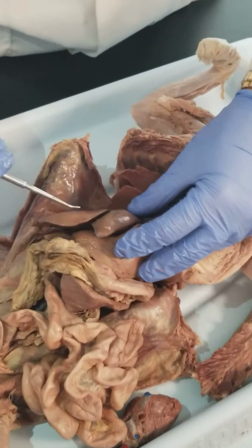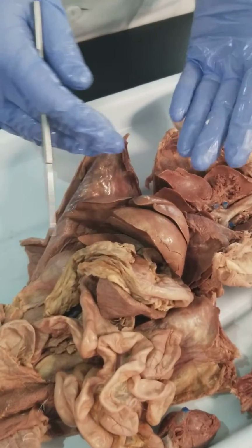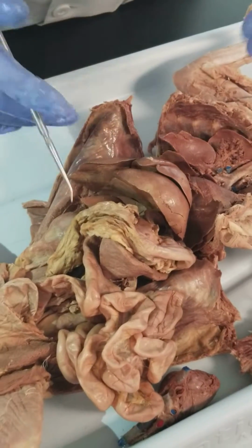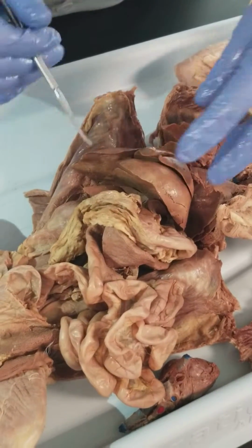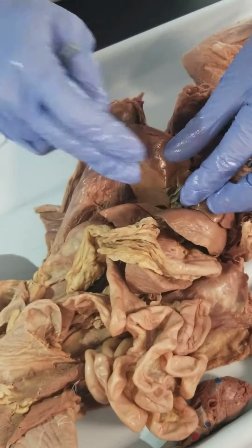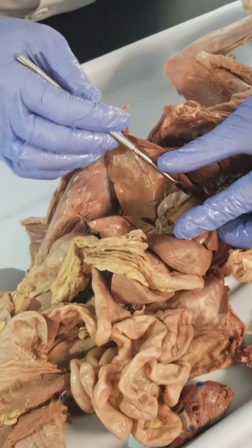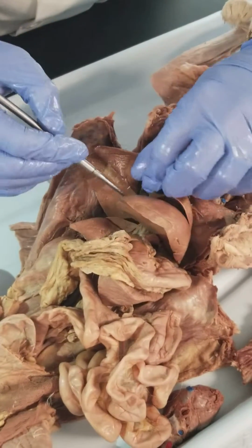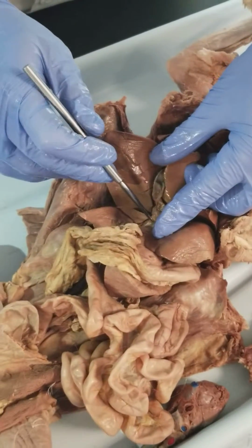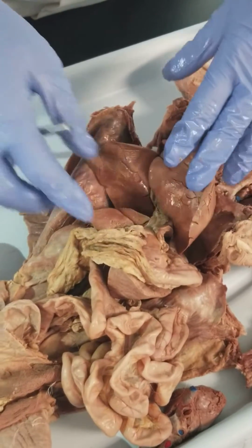And then we have the liver of the cat here. The cat's liver is, orientation-wise, a little bit different than ours. We have right and left, caudate, quadrate. The cats sort of have them all over the place. But as you start to peel this apart, you can see that's the gallbladder right there. It typically has a little bit of a greenish hue to it. And that's probably about the most you can make of that. You can't really follow the ducting system, like the cystic duct and the hepatic duct going to the common bile duct. That's the reason why we have the models, so we can see that a little bit better.